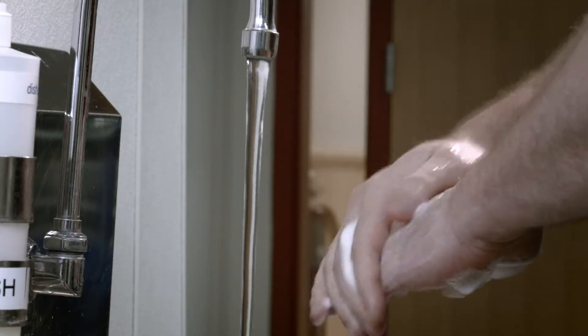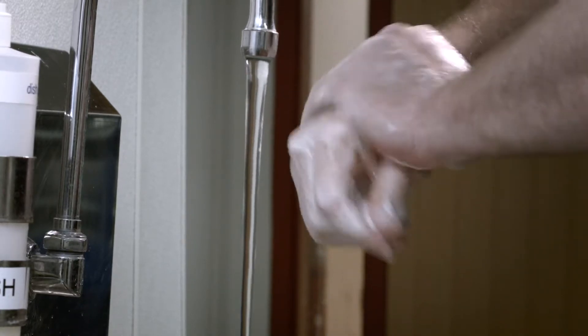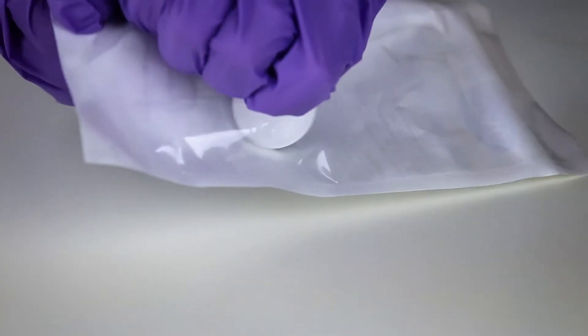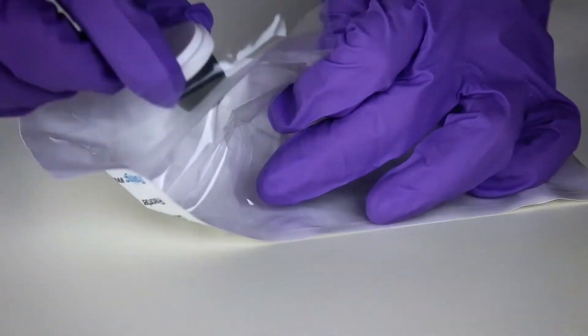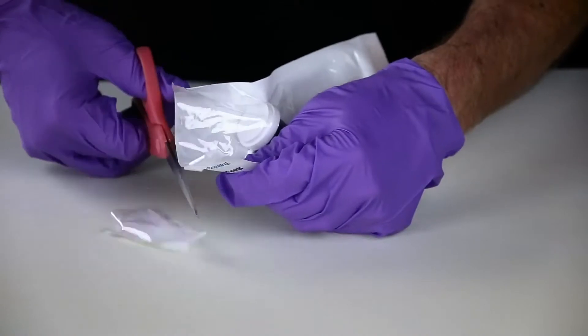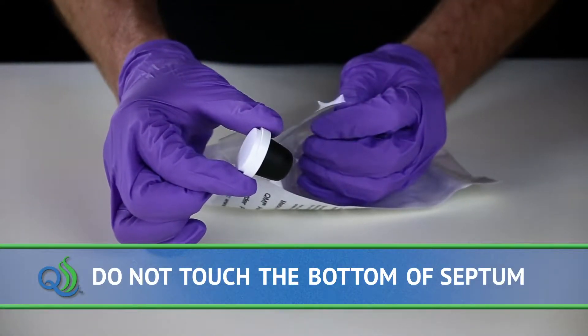To begin, wash hands thoroughly prior to putting on personal protective gear and disposable gloves. Remove the appropriate QualiTrue septum from the package by peeling the clear cover away from the white backing or cutting the plastic package. Be sure not to touch the bottom portion of the septum.